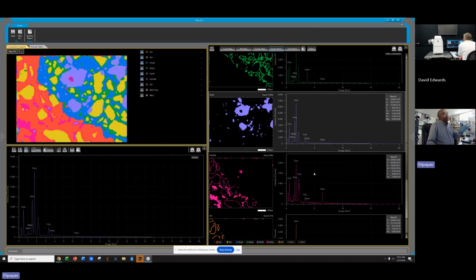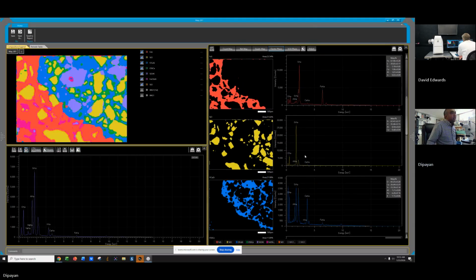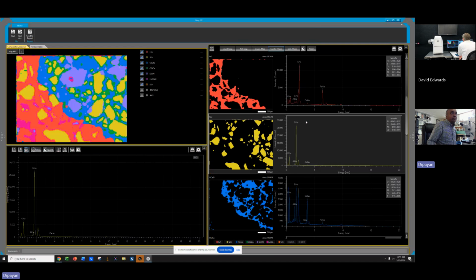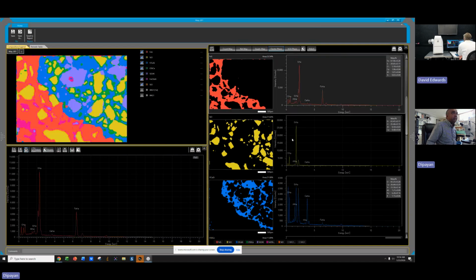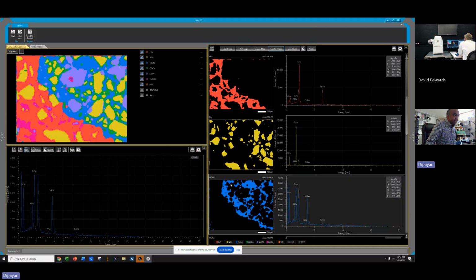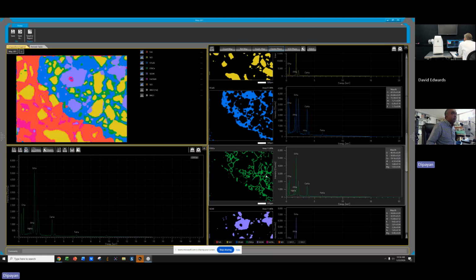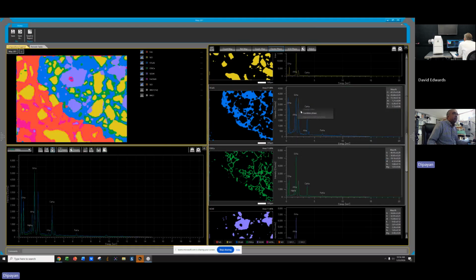So it is clear, there is no problem, of course. It's a pure SiO2, no problem, which is pure pyrrhotite. The main phase, I have no problem. Even in the paste, I have no problem. It is paste. But this is a margin. I don't need the margin, and this margin can be mixed with the paste, maybe.